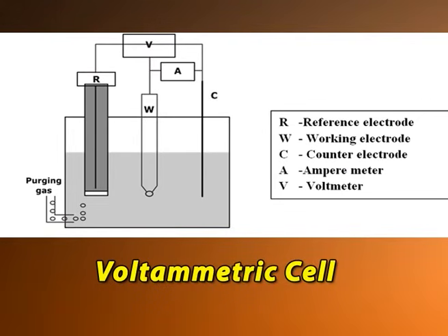For harmonizing the total charge in the electrochemical cell, counter reaction occurs at the auxiliary electrode. The concentration of the electroactive species of interest present in the electrochemical cell changes on the surface of the working electrode by electrochemically oxidizing and reducing these species. This results in flow of mass in the direction of the electrode, that is, the concentration changes, and this current flowing across the electrode solution interface is found to be directly proportional to the concentration of the analyte.